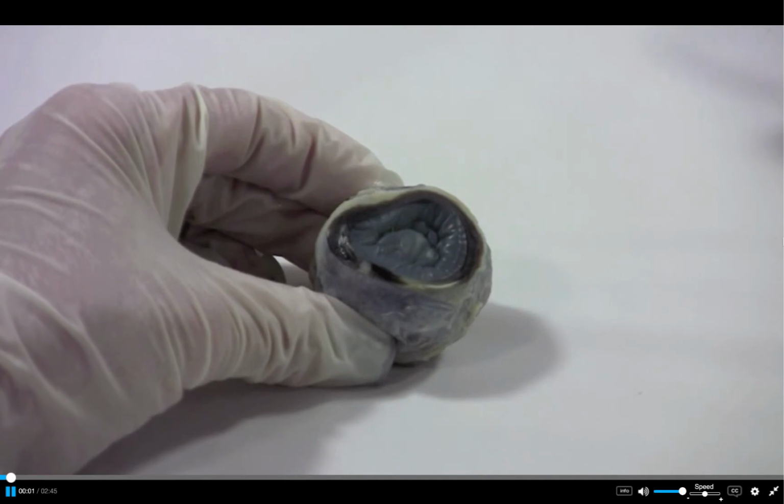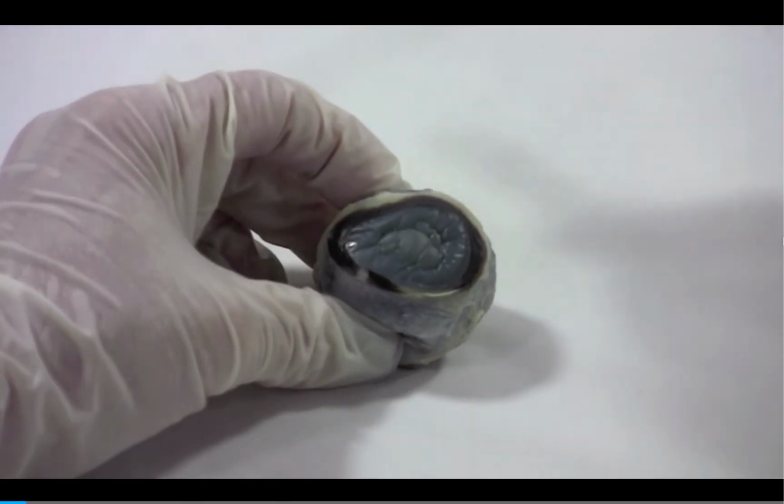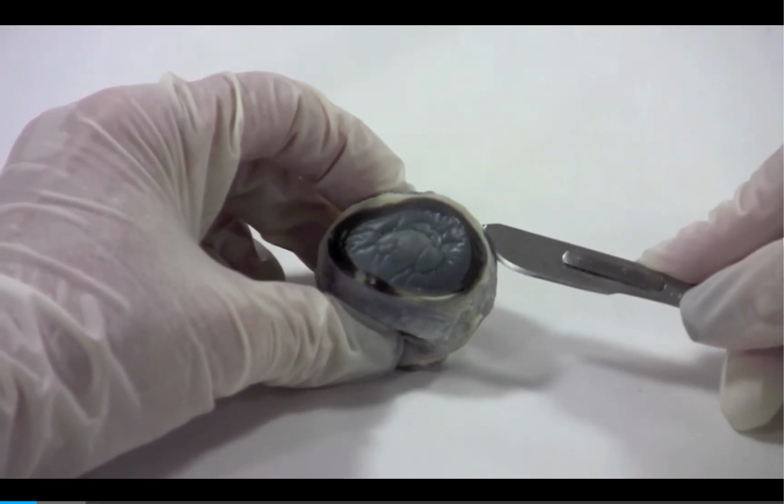Let's cut the eye into a frontal section so we can look at the structures of the posterior segment, which is located behind the lens.